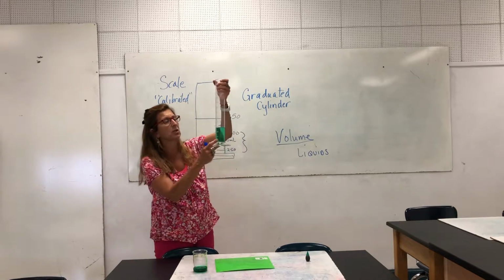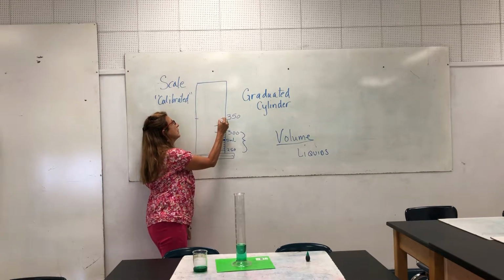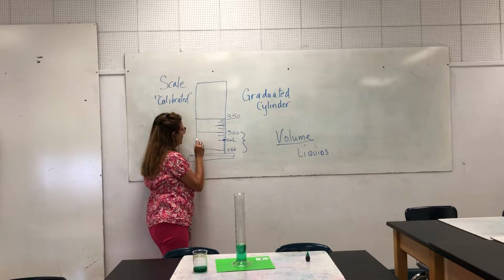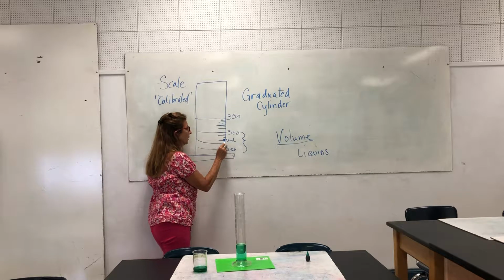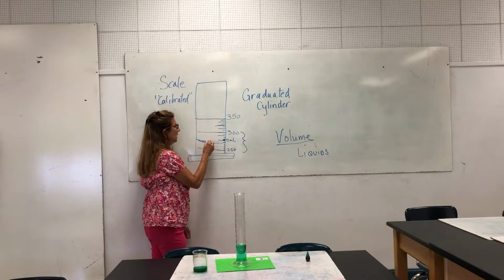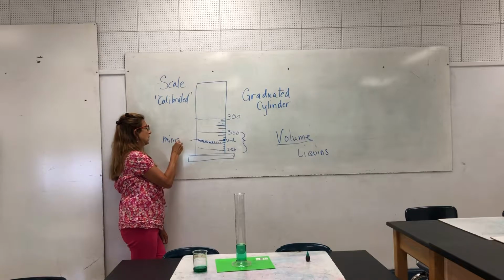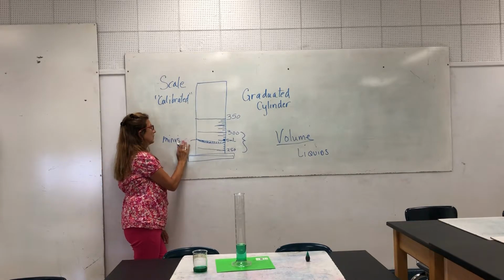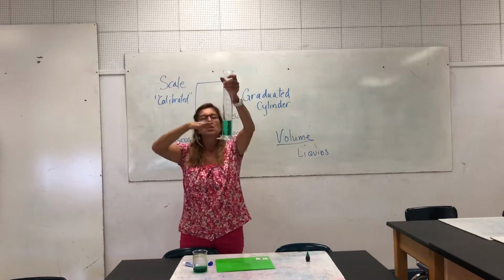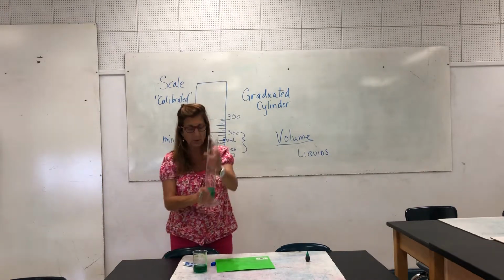And so if I want to read this particular cylinder, there's another trick that I have to know about. So as I fill that cylinder up with fluid, you'll see these lines going across. That fluid comes up, and where the fluid is, there's an interesting phenomenon that happens on a cylinder. There's like this area where there's almost like a shadowy top to the fluid. That area is called the meniscus. The meniscus. It's almost like the liquid goes up the sides just a little bit and goes down in the center to create this area called the meniscus.